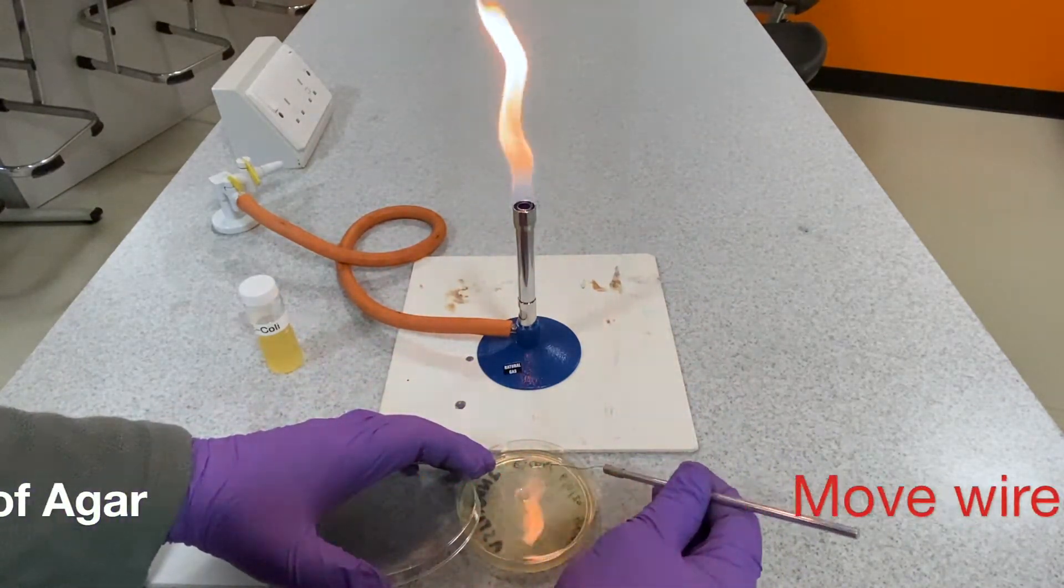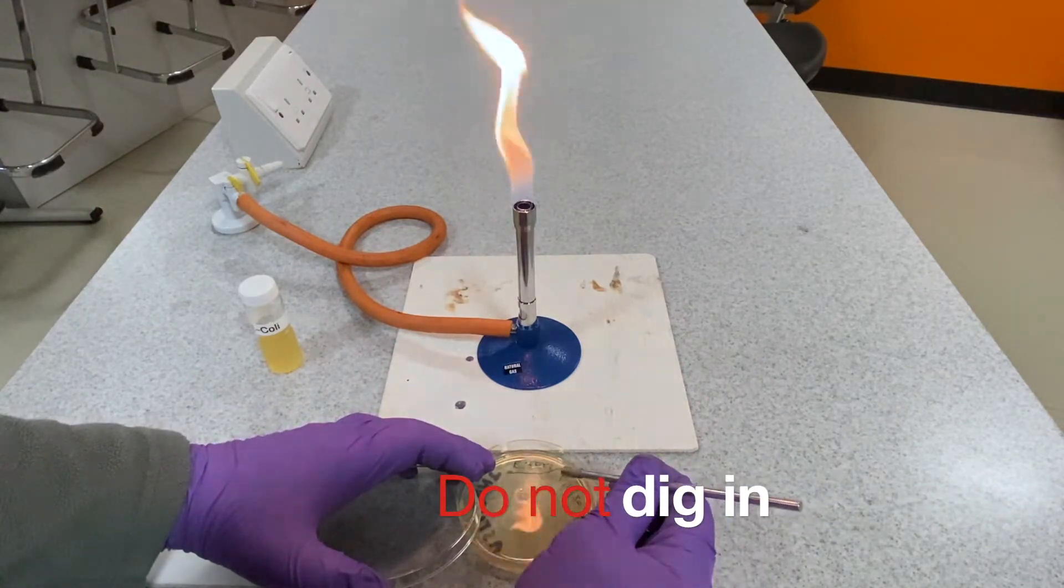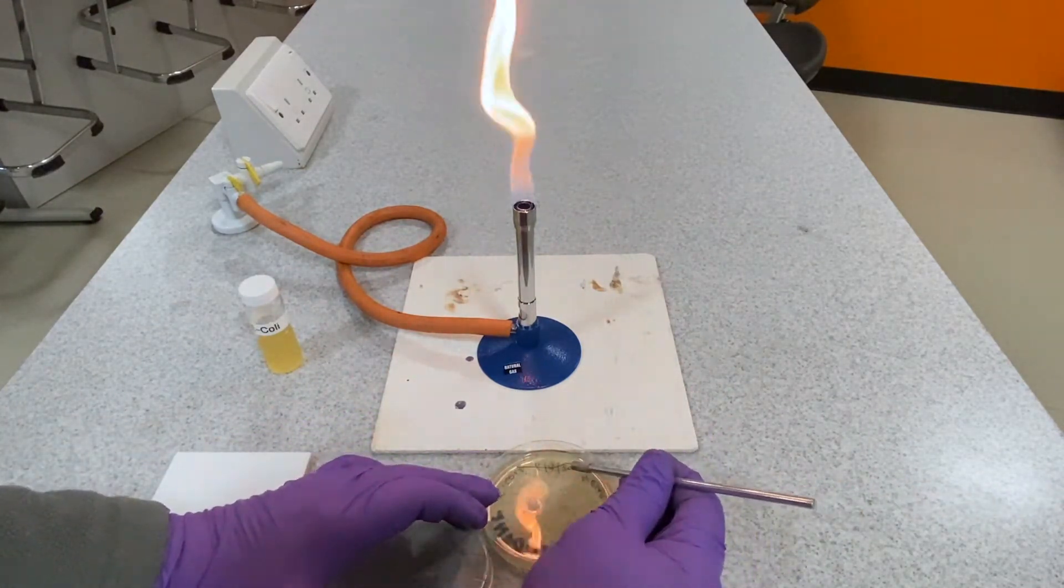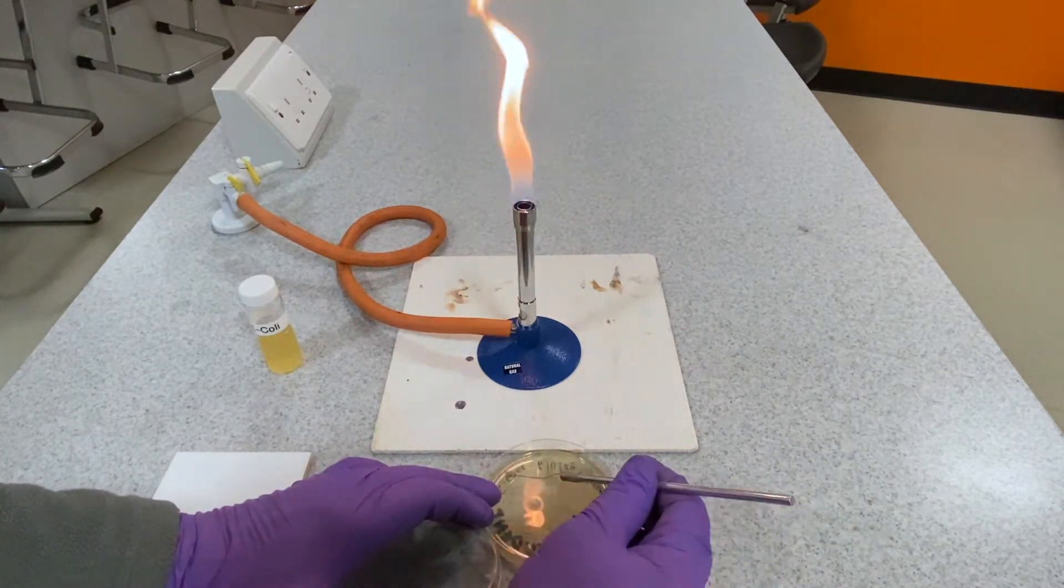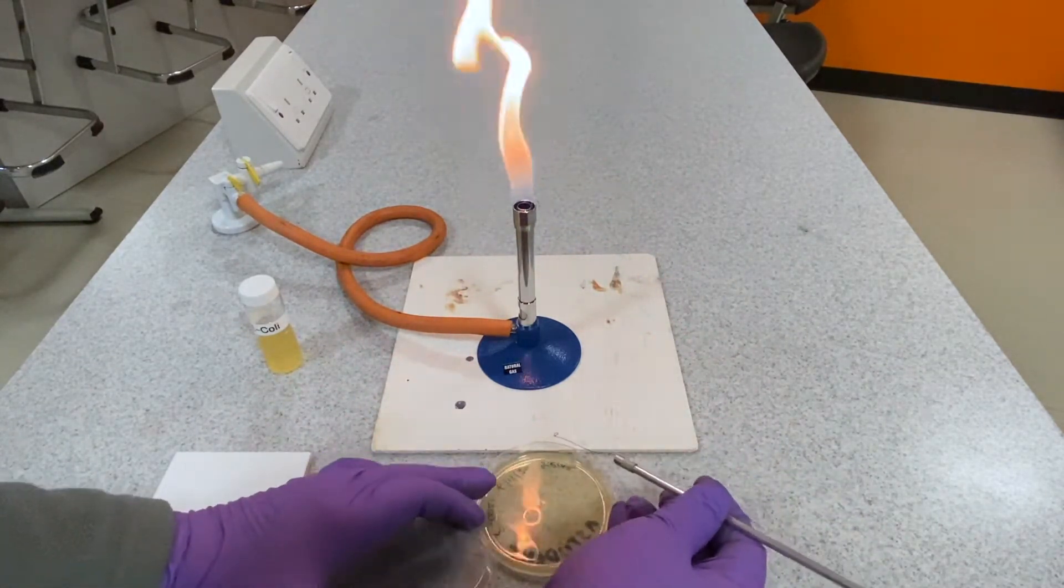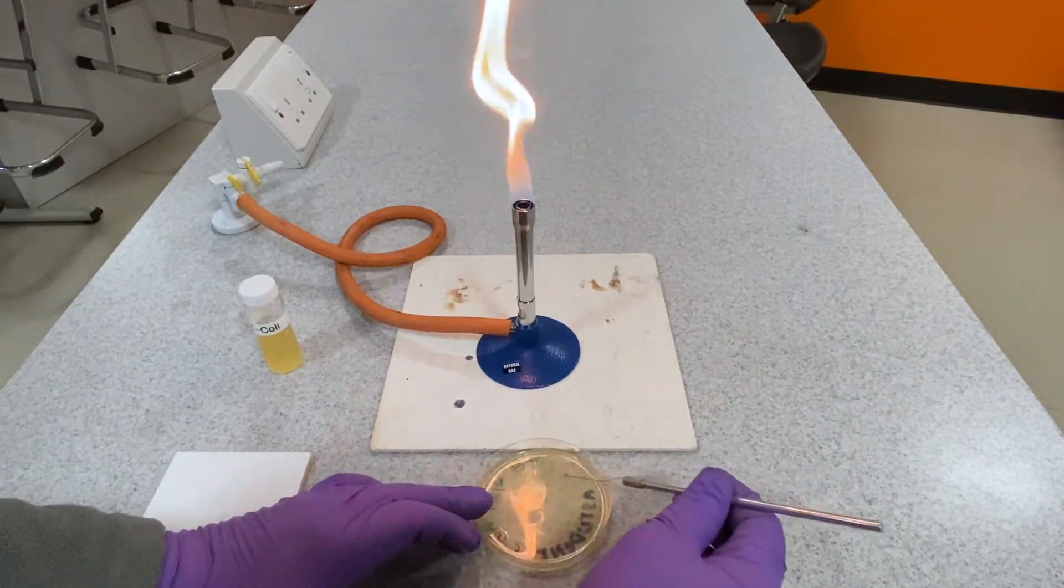Transfer the bacteria from the wire loop to the surface of the agar plate. Take care not to dig in below the surface of the agar as this may create anaerobic conditions and allow the growth of harmful bacteria.